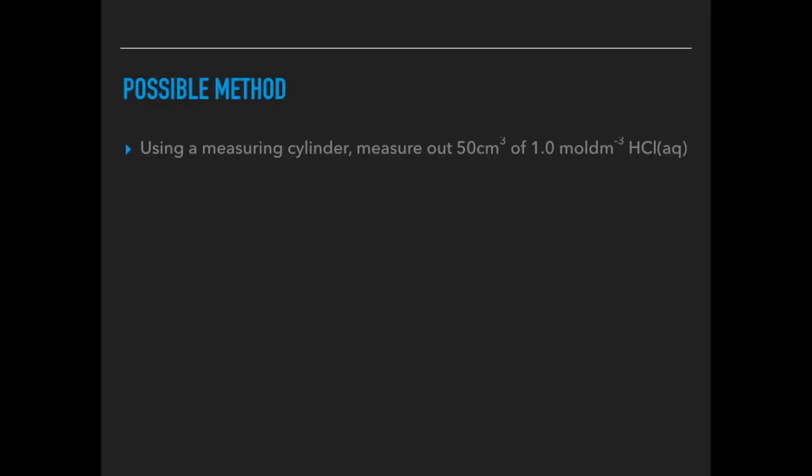The first thing, using a measuring cylinder measure out 50 cm cubed of 1.0 mol per dm cubed hydrochloric acid. You don't have to choose the exact volume and concentration I've gone for but the acid's going to end up in a polystyrene cup so we don't want too much and we want a decent temperature rise out of the reaction. If you went for a low concentration you probably wouldn't get a big enough temperature rise. Into a separate measuring cylinder measure out the same volume and concentration of sodium hydroxide solution. You'll see why that's important when we come to the calculation.